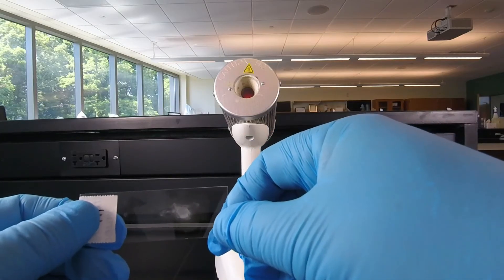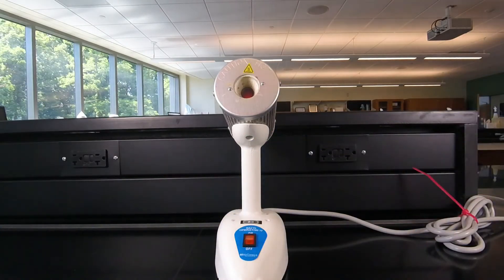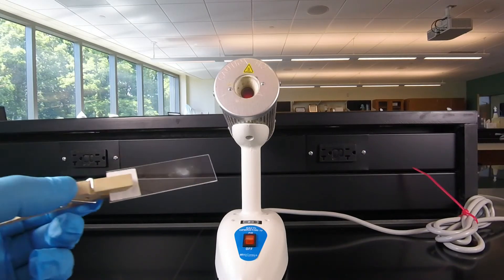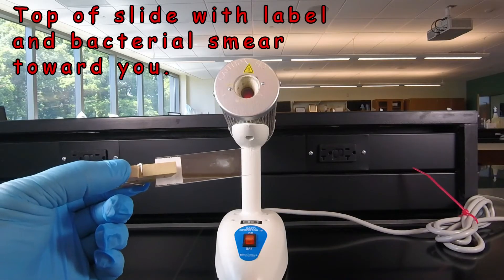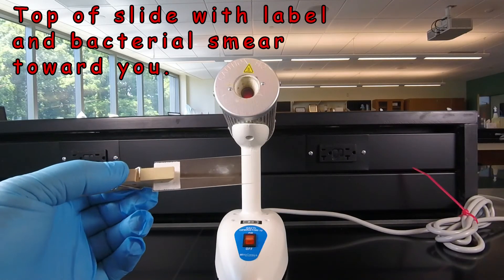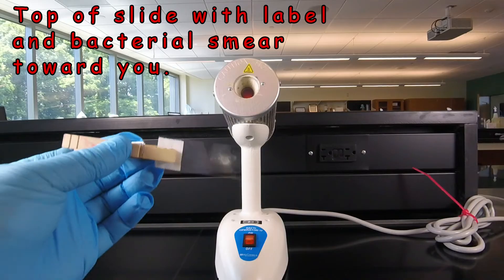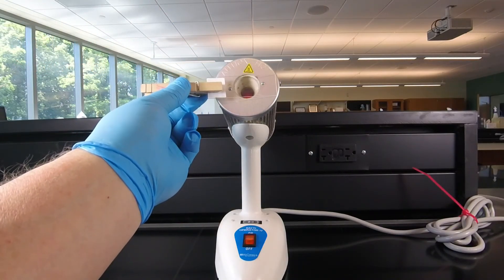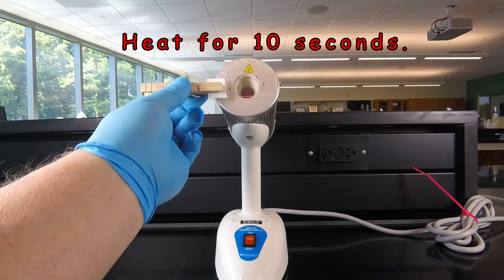So now we're ready to heat fix the slide. We're going to place the slide in a clothespin, making sure that the side with the label and the bacteria is facing us. We want to heat the bottom of the slide, not the top. We're going to place it against the opening of the Bacti-cinerator and leave it there for 10 seconds.